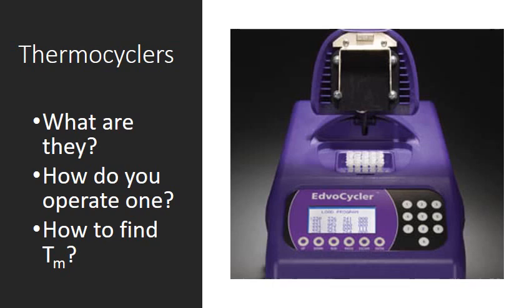All right, thermocycler, it's also called a thermal cycler. It depends on the text that you're reading it from. Essentially, it's the same thing. They also call it DNA amplifier. And it's got several different names. Just one simple piece of equipment that does a lot of heating and cooling really quickly.